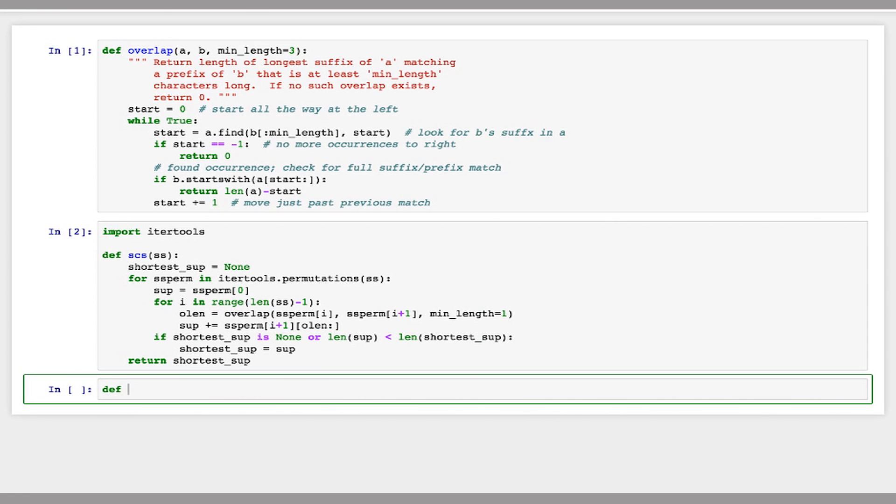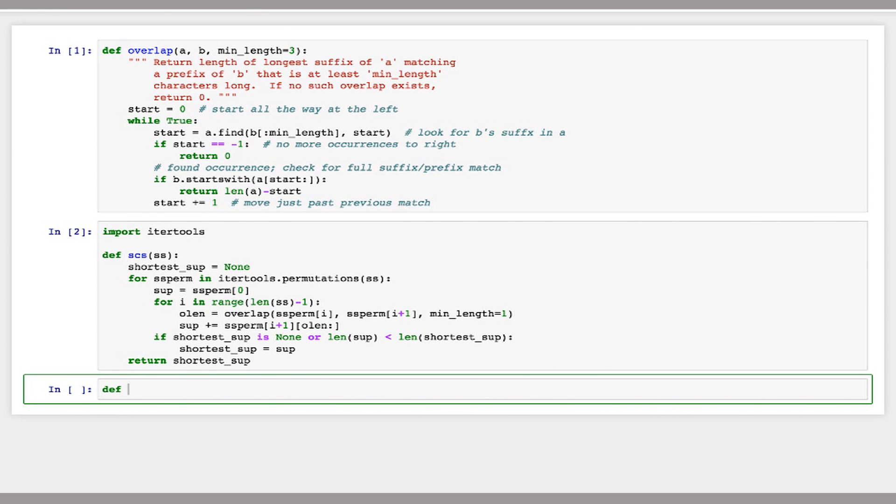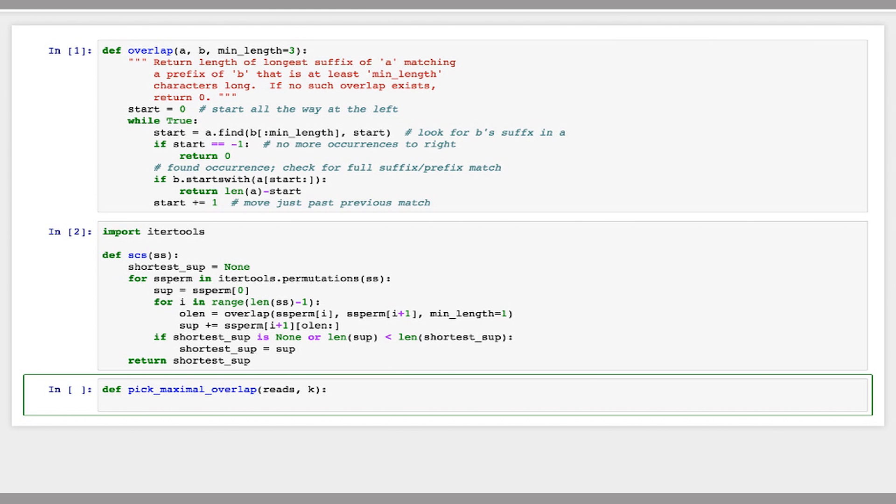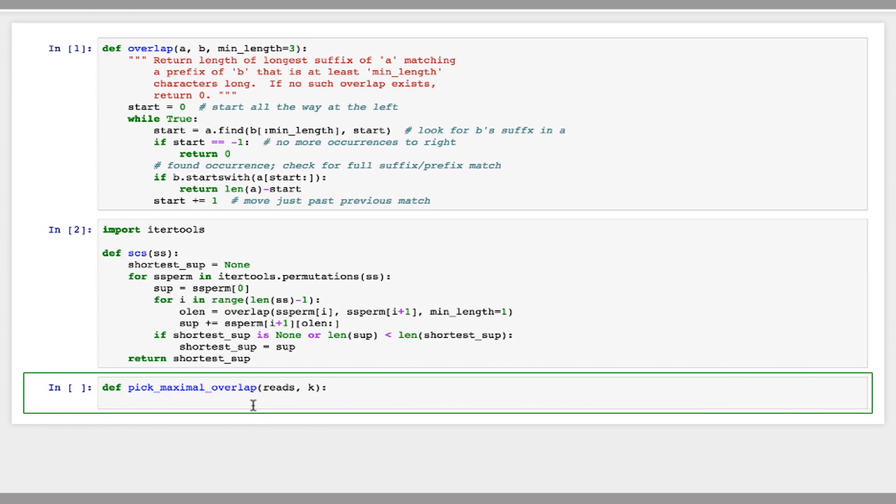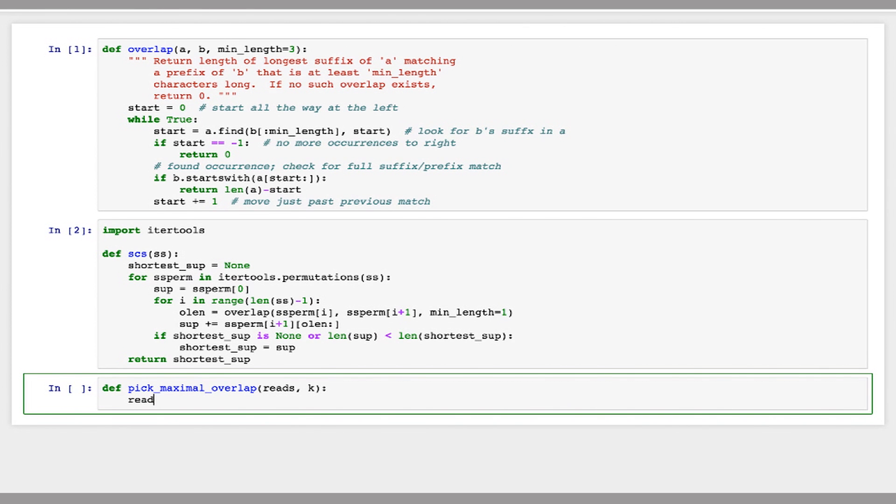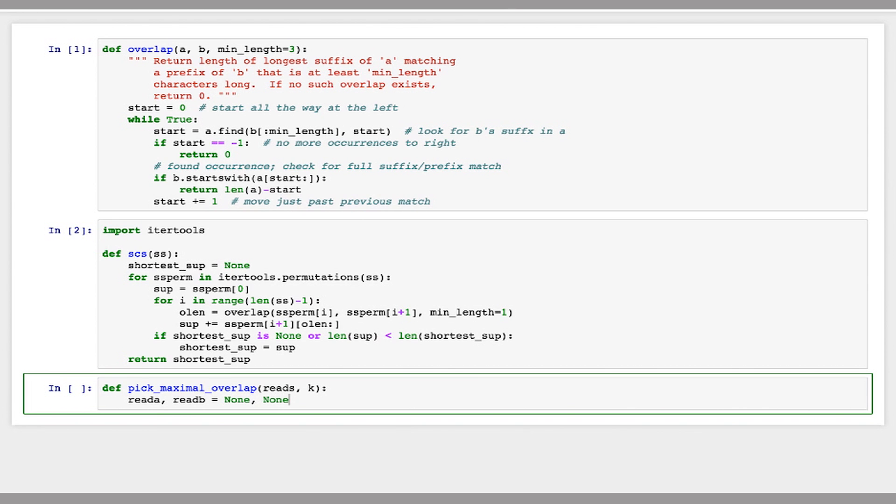So a helper function I'm going to write is pick maximal overlap. And this will take a set of reads and a minimum overlap k, and it will return the two reads with the maximum overlap along with that overlap. So to do this, I'm going to define read a and read b to be none. And then I'll keep track of my best overlap length, which initially will be zero.